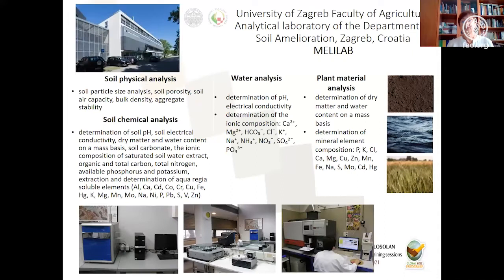Here is a short presentation of the institutions involved in this training. At the University of Zagreb, MeliLab is an environmental chemistry lab which carries out several both routine and specific chemical and physical analyses focused in general on soil-water relations. You can see here the list of the analyses we carry out: soil physical analysis, soil chemical analysis, water and plant material, and also some other analyses as well.